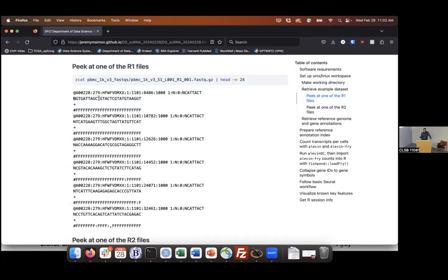Sometimes we're more confident, based on the imaging process, that the sequencing is occurring correctly, so it has a higher quality score. Sometimes weird other things happen, and so we're not very confident. Each base gets a quality score on a scale of 0 to 40, 45, and it's encoded in this weird alphabet. You can look up what each character corresponds to. You can see the very first base on some of these is an N.